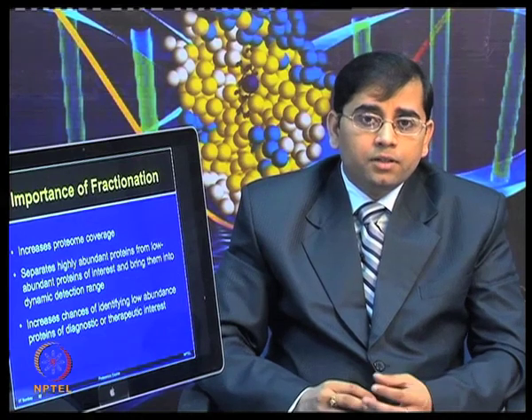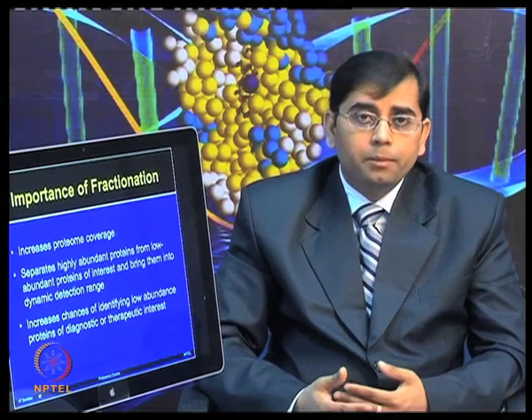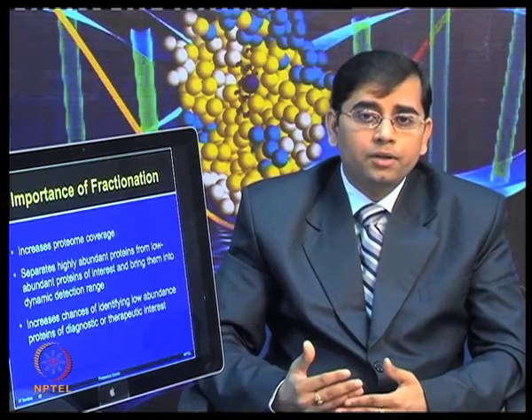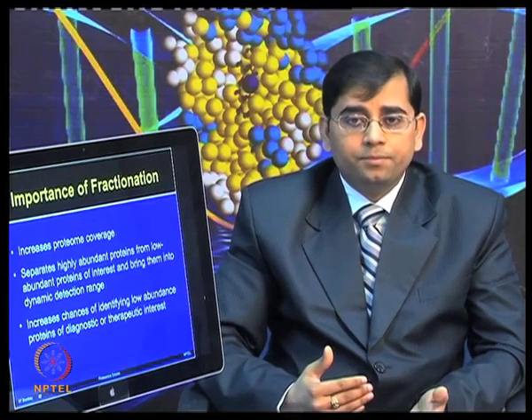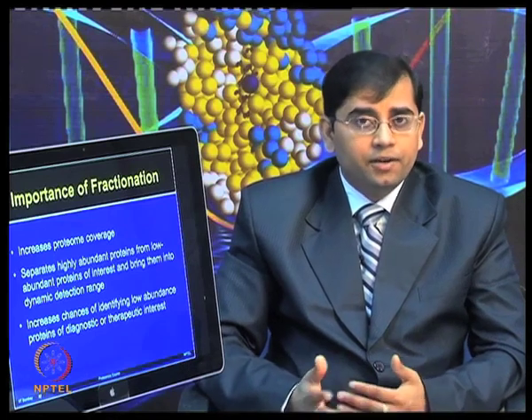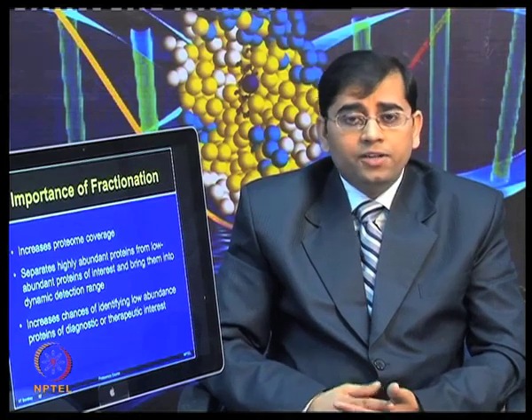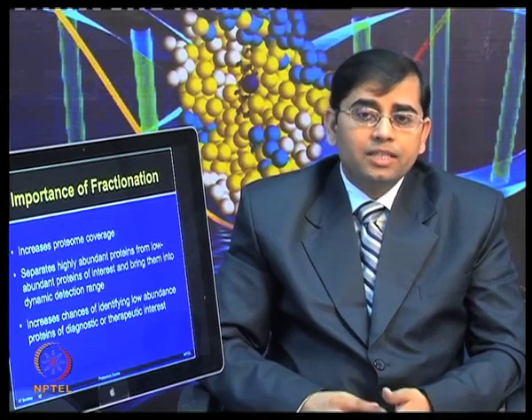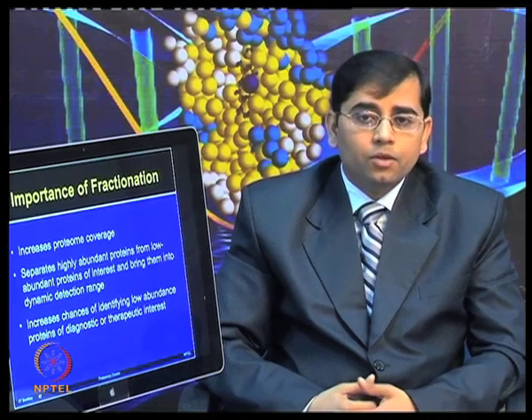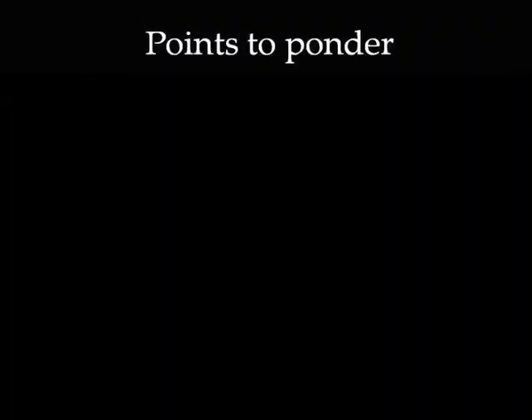Often, the low abundant proteins are the proteins of interest, which are being masked by the highly abundant proteins. If you are able to separate the highly abundant proteins, then you are able to increase the dynamic detection range and bring everything into the same range. Fractionation can also increase the chances of identifying low abundance proteins of diagnostic or therapeutic interest.